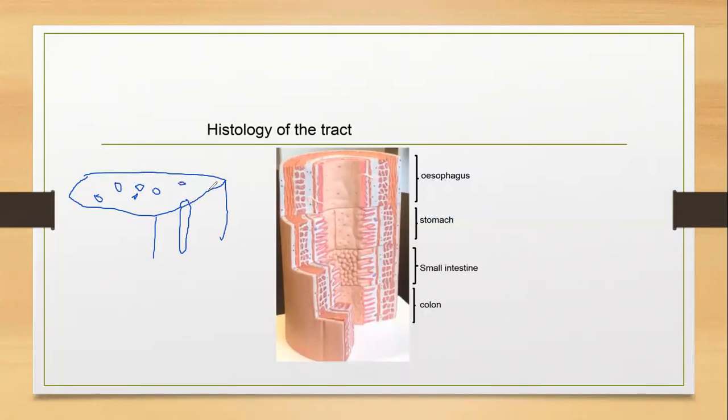But when you go to the edge where there is a pore, you find it has an indentation of the epithelial lining forming the gastric gland, and this is what you are seeing here. So these are the pores and these are the glands. Now you can see even within the esophagus, you had these pores that are extending from the submucosal gland, and this is one of them. Remember, it is going to the submucosal area, and they are the ones which produce mucus within the esophagus.